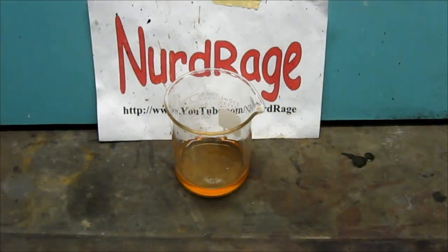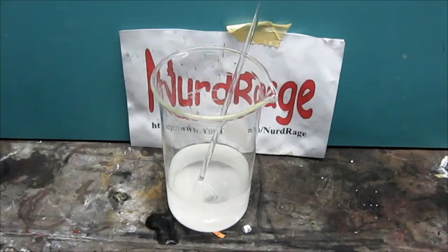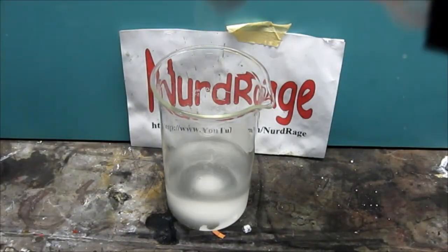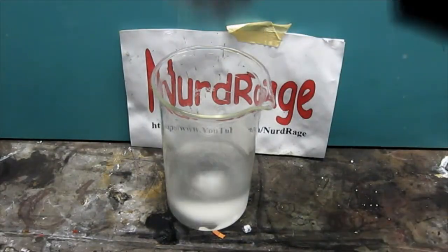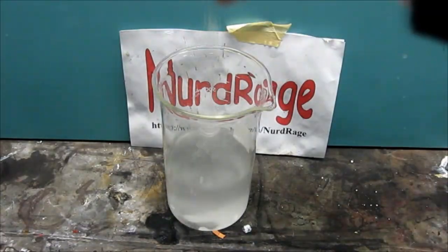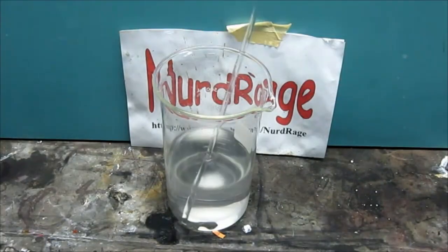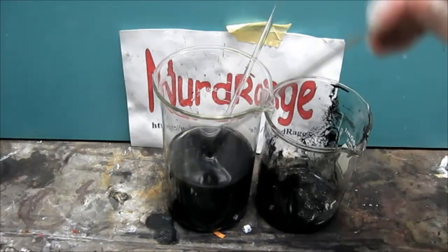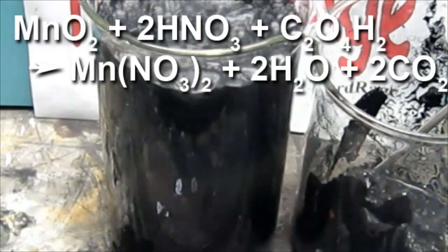Now manganese nitrate requires a bit more work. The procedure however is very similar to how we made manganese sulfate, but instead of using sulfuric acid we use nitric acid. So we just make a solution of 30 grams of oxalic acid and 32 milliliters of nitric acid in 300 milliliters of water, and just keep adding washed manganese dioxide battery paste until it stops fizzing. The redox reaction is very similar to the one used for manganese sulfate.